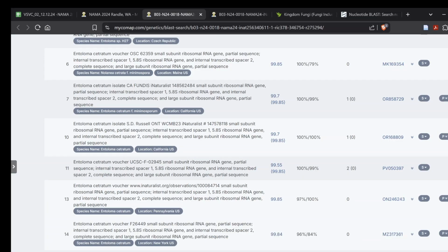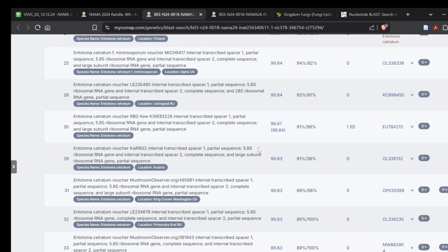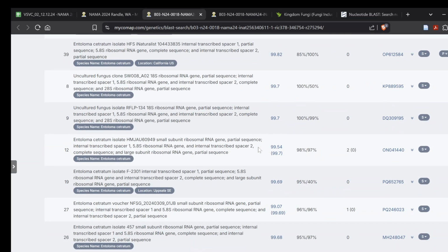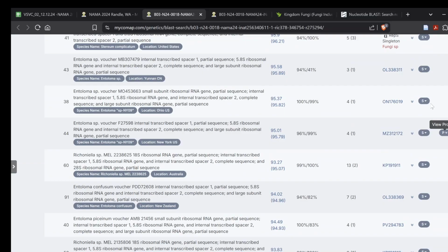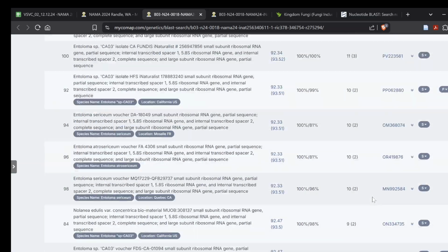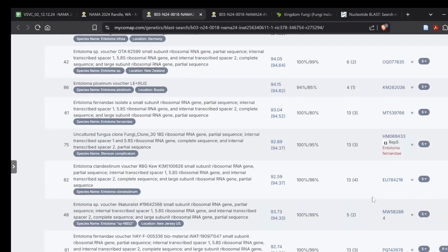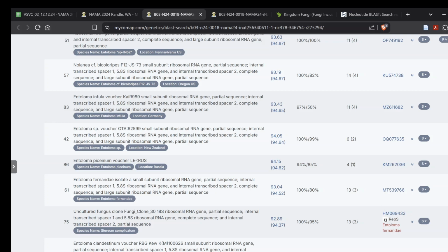First thing I'm going to want to do, hit show more. I want to look for a type specimen, and that would show up here on the right hand side if there was one, and I don't see one, but occasionally you see these. These are imported from Unite, or rather, they exist on Unite as well as NCBI, and it's considered representative sequence for whatever that taxon is.